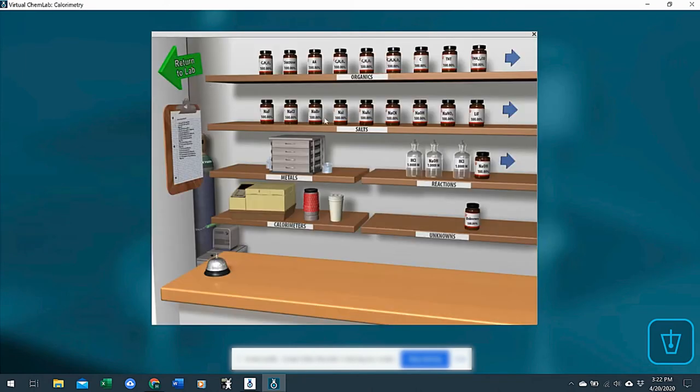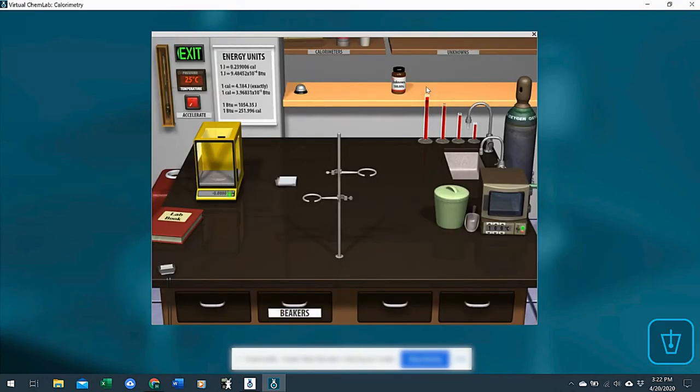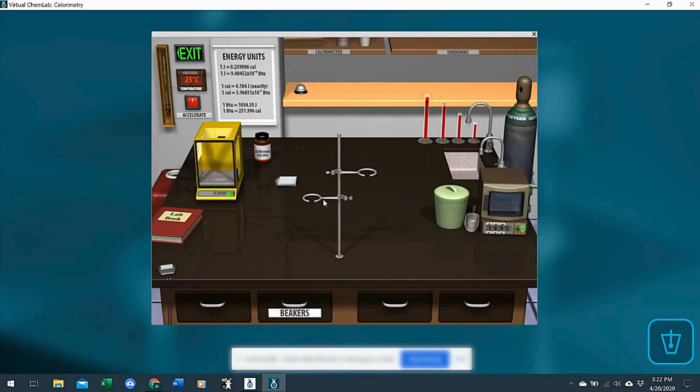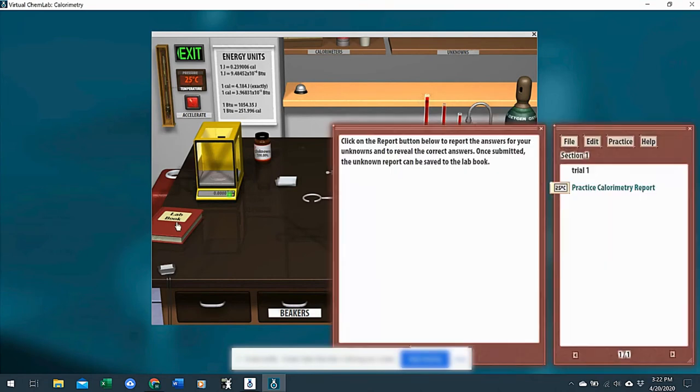So there's an unknown created here. And they could then go back into the lab and find the heat of solution by adding this to some solution, measuring the change of temperature, and they would report that in the same way.